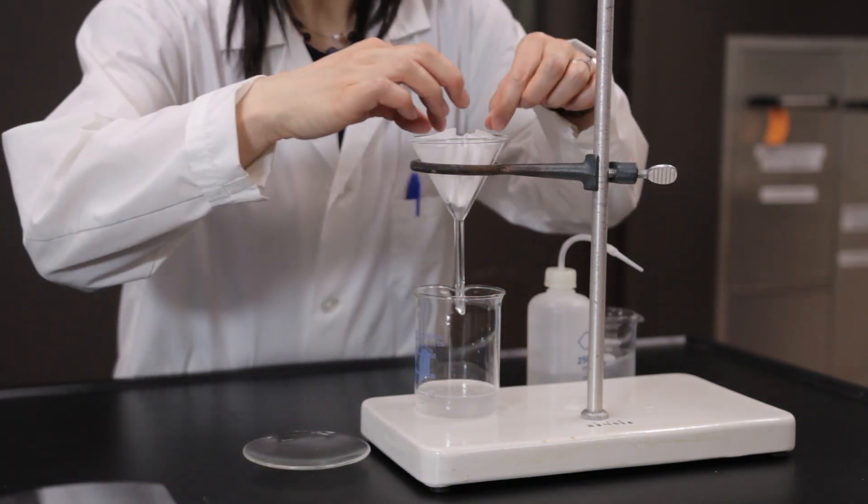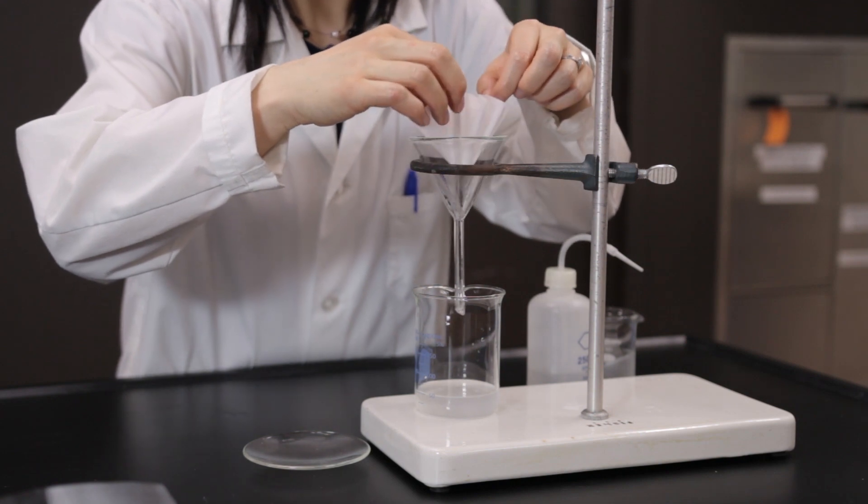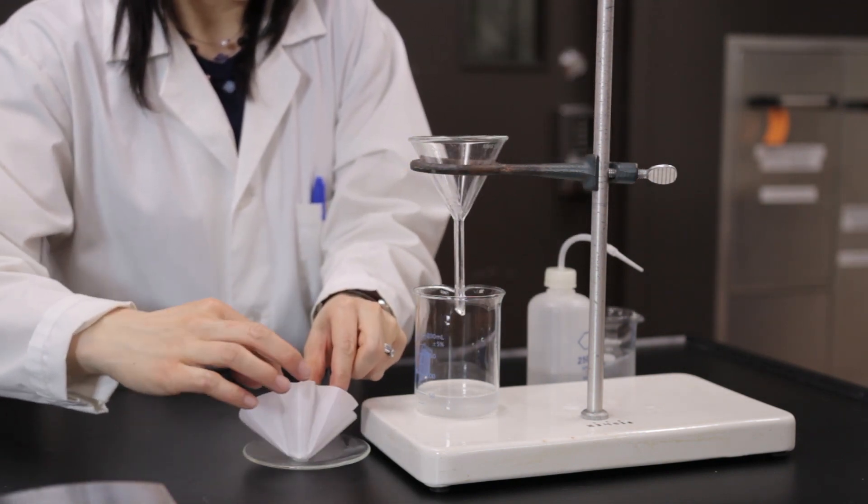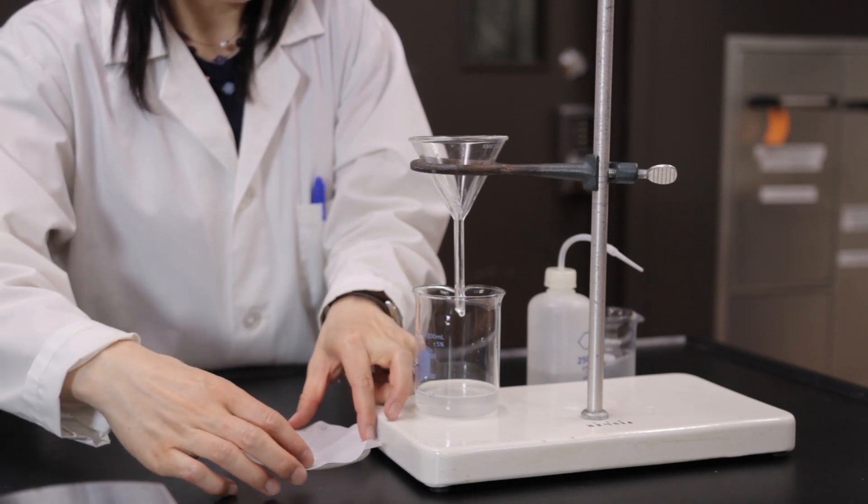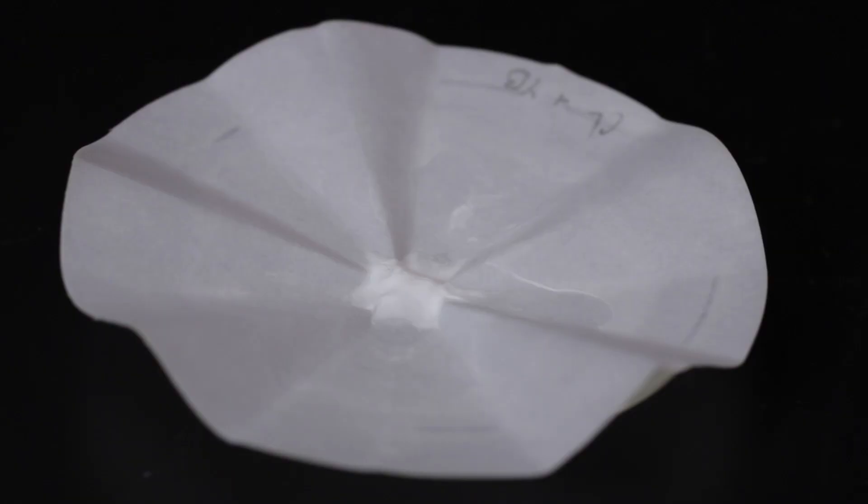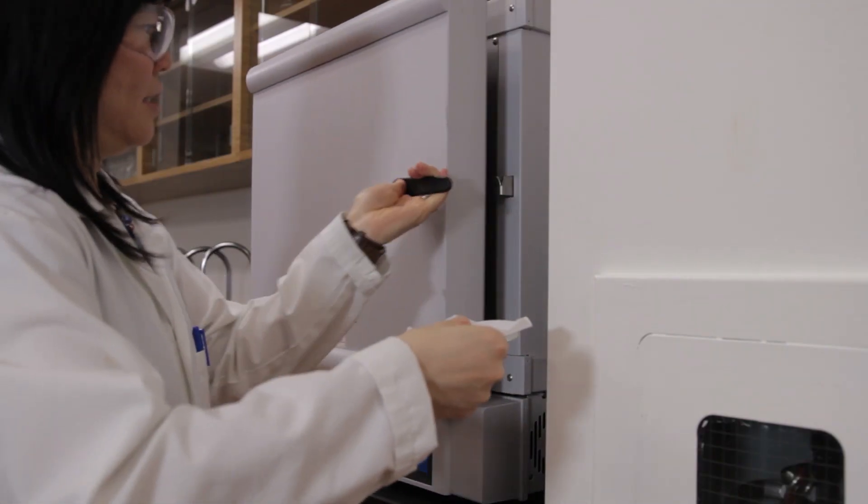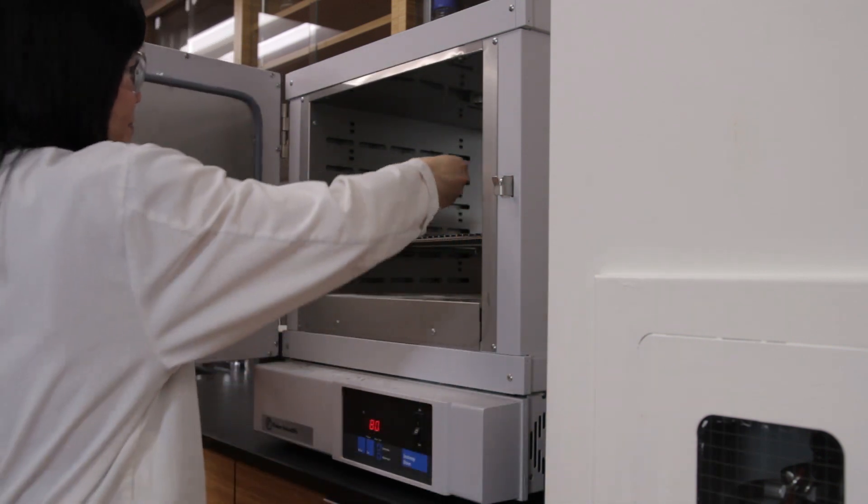Open the filter paper containing the precipitate and place the paper onto the same watch glass that was previously weighed out. Discard the filtrate. Place the filter paper and watch glass in the oven to dry for about 15 minutes.